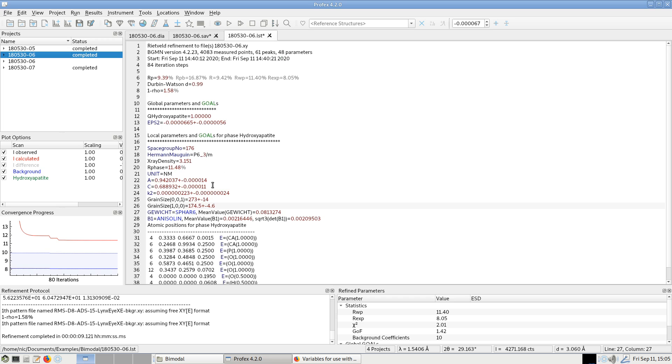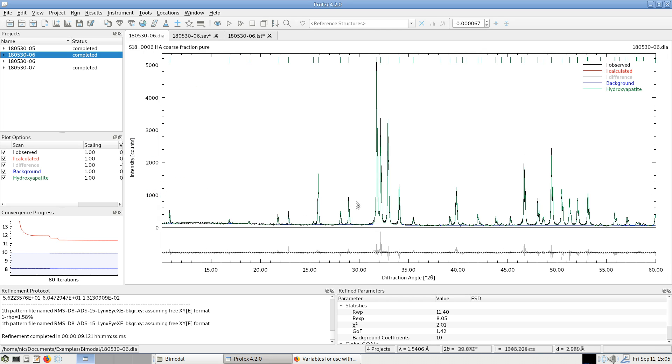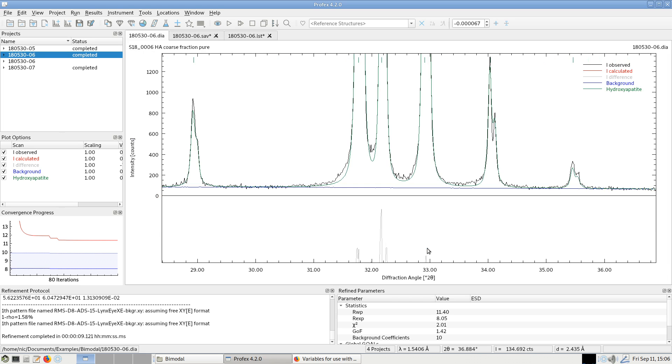We got with only the coarse fraction the size of 273 nm along the c-axis. And it's probably just because this fraction by itself is already bimodal. You can see if we zoom in to the feet, there is of course a fine fraction here. The fit of the feet was not very good, but it's much less than in the other example.